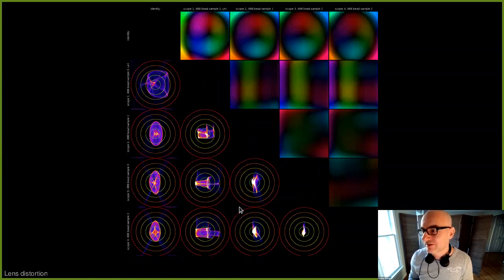And we also figured that over time these things change. So after each time a technician comes in and calibrates the system, we'll have to do a new lens correction model, which isn't terrible, because it's like, I don't know, once every 6 months or something. But since currently it's a little bit manual, and I will show you how you can reproduce this, it usually falls on me to do this, which is fine.